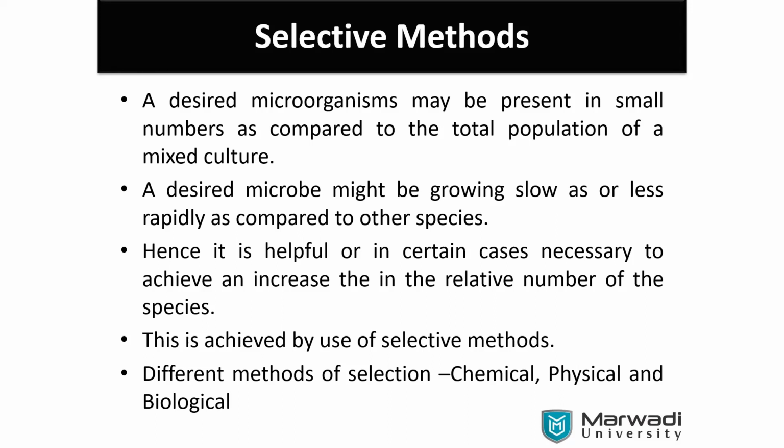A few things are there in it also. Some are very much blank. That is good, they have done well. Now there may be two reasons. We have kept them within our incubator. It does have fungal or other spores prevailing from the beginning.